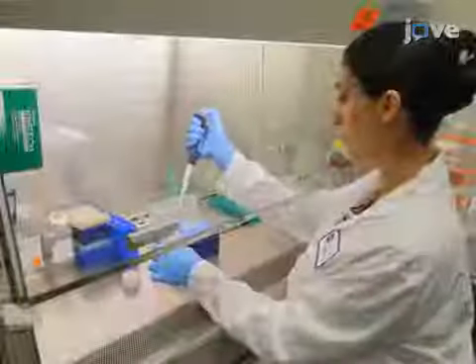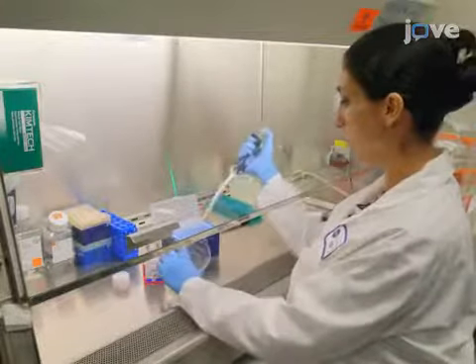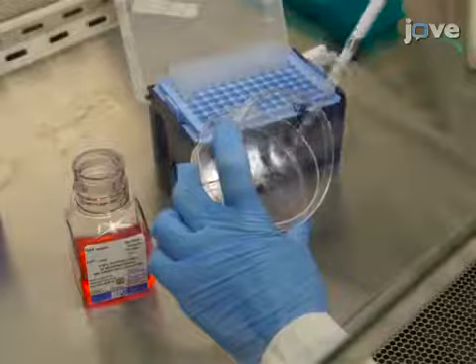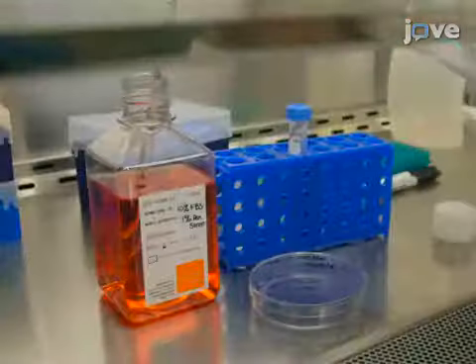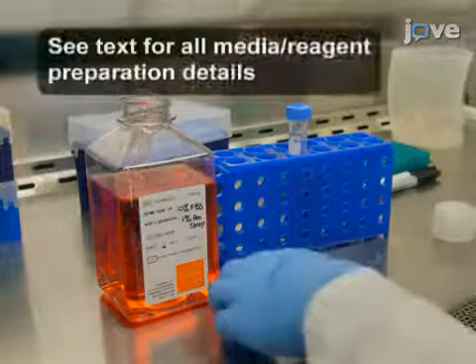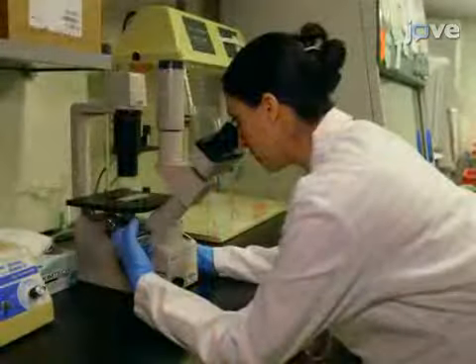To harvest the CHO iCAM cells, treat the culture with 0.5% trypsin EDTA for one minute at room temperature with gentle shaking. When the cells begin to detach, neutralize the trypsin with 4 milliliters of fresh medium and count the number of dissociated cells.